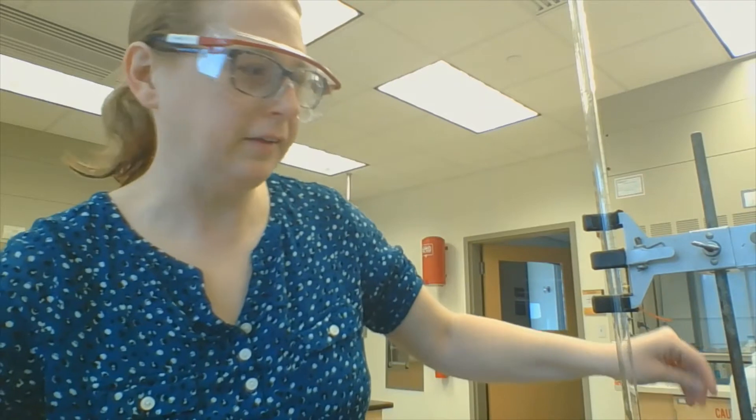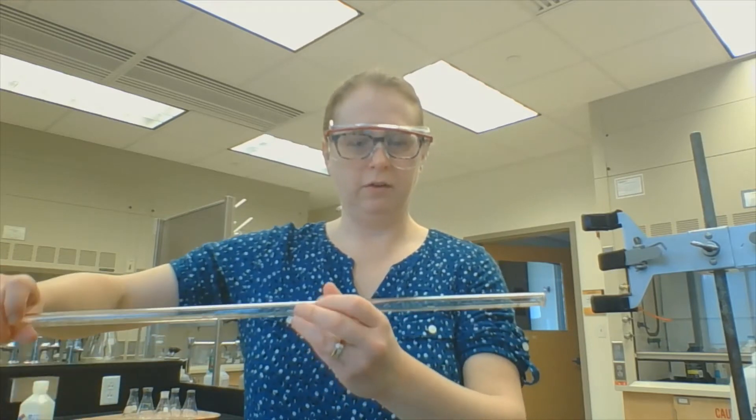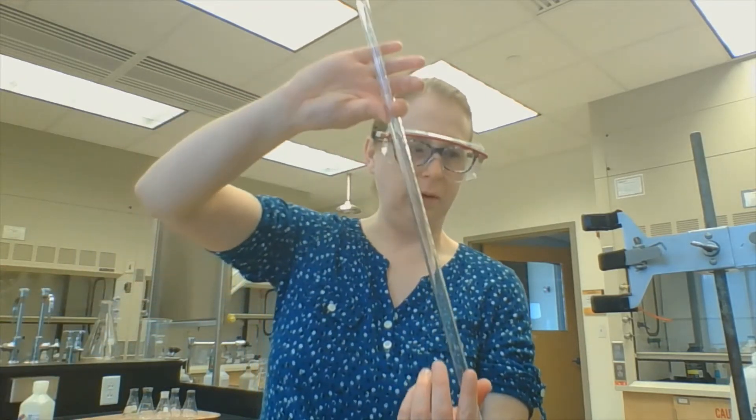I didn't use my funnel that time and now I've got soapy sodium hydroxide on my hands — take that as a lesson for yourself. I'm going to swish it around a little bit more and again pour out the top just to rinse really well.